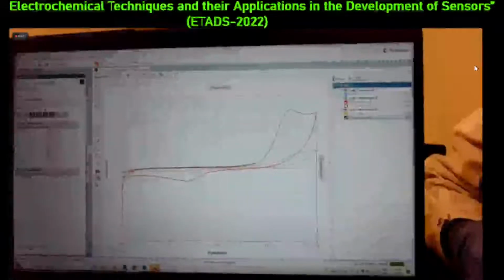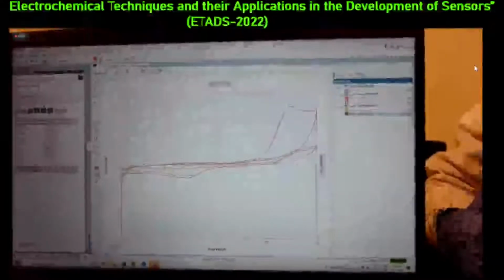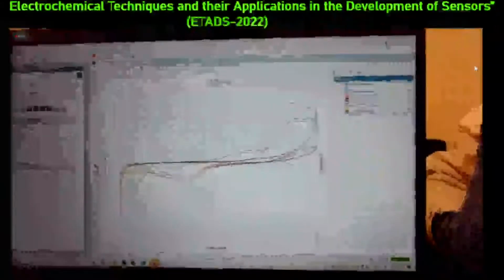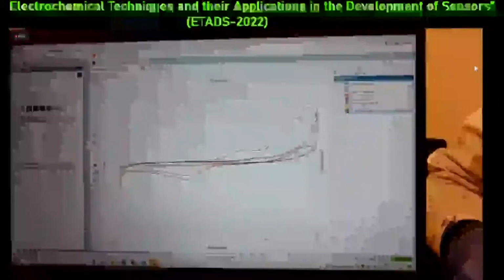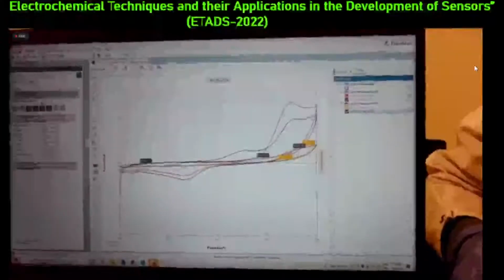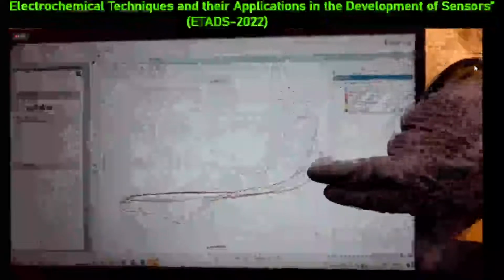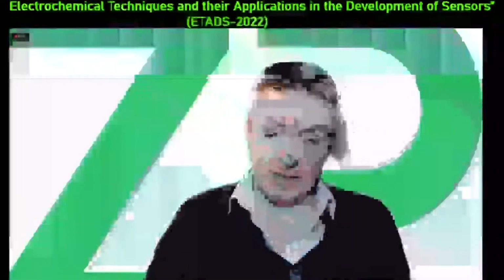Don't know how to pronounce that, unfortunately, but as you can see, the oxidation peak is way lower, which indicates that we have less capsaicin in the solution. And capsaicin is related to the Scoville heat units, so it indicates the strength of the chili sauce, which we just demonstrated with these two peaks belonging to Tabasco and these two peaks down here belonging to the Sambal Ulek. Yeah. Brilliant. Well, thank you, Solran.